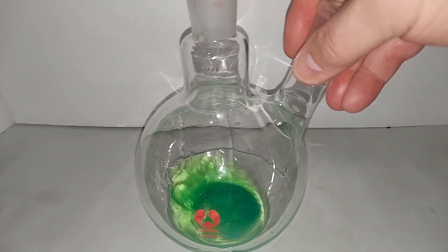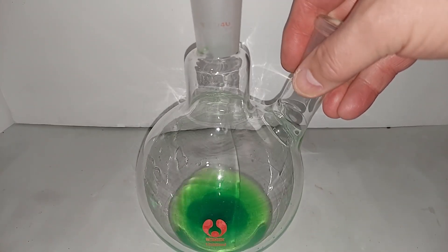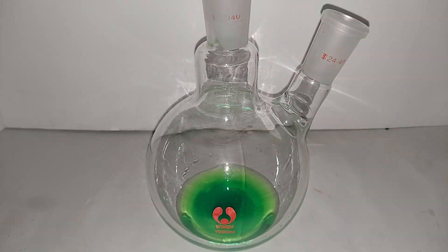I'm just going to swirl that around a little bit. Now I'm going to add the little rod of aluminum, and you really have to wait until the aluminum starts to fizz — and you can see it there.